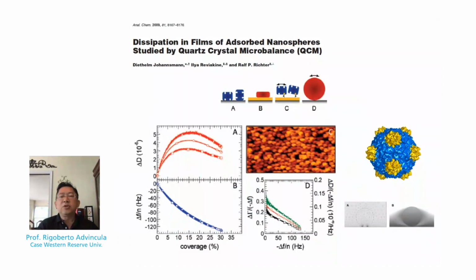Unlike a viscoelastic continuous film, the particles or cowpea mosaic virus itself is able to rearrange as point particles on a surface. Thus, even though the frequency shift of the same mass or amount deposited on the surface with various viruses, sizes, the changes in the equilibrium or rearrangement observed can be correlated with the size of the particle.